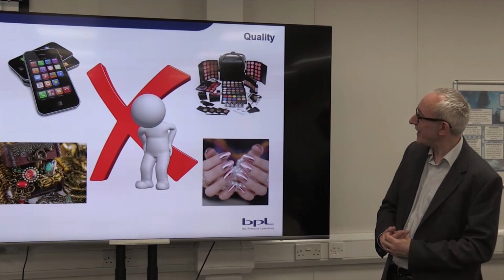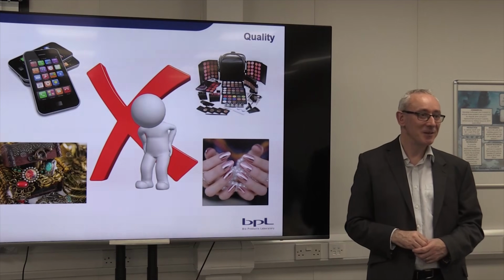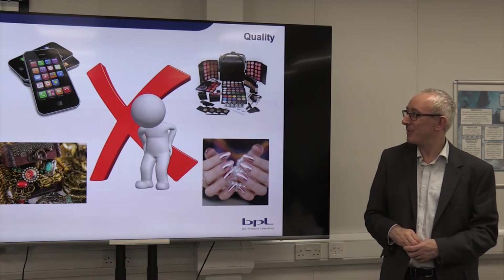Okay, and there's just an example slide of the things that you're not allowed to take in or wear within the clean room.